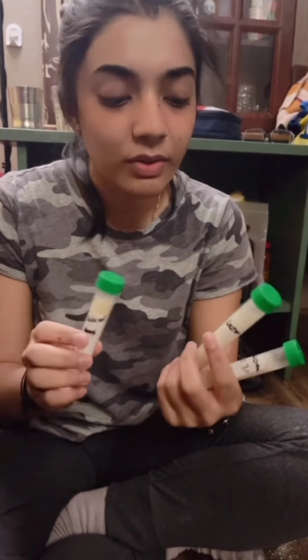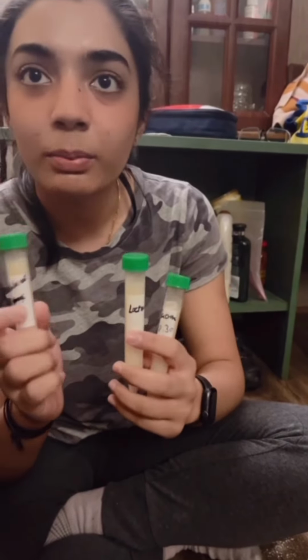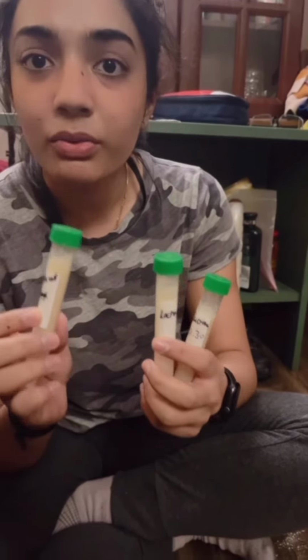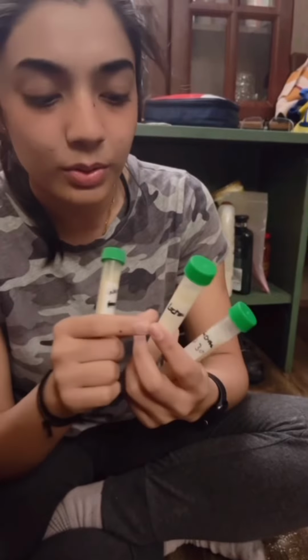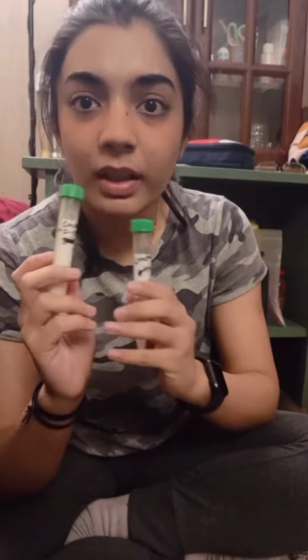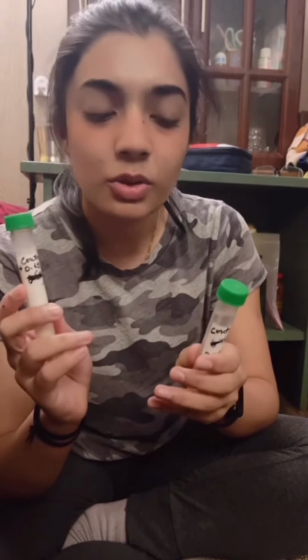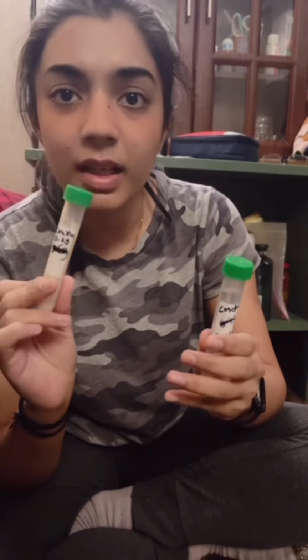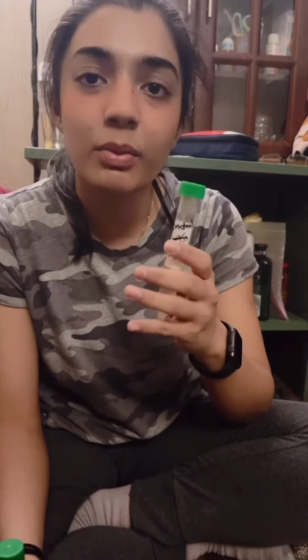Trial 1, week 3, we have used 0.6 gram of yeast in each of three tubes, and then 10 ml of water in each, and then 3 grams of glucose, 3 grams of lactose, and 3 grams of sucrose. For this one we have used two controls. For control number 1 it's 0.6 gram of yeast with 10 ml of water, and in another control it's 10 ml of water with 3 gram of sugar. In 3 gram of sugar, it's 1 gram of each of the 3 sugars that we have used for the test.